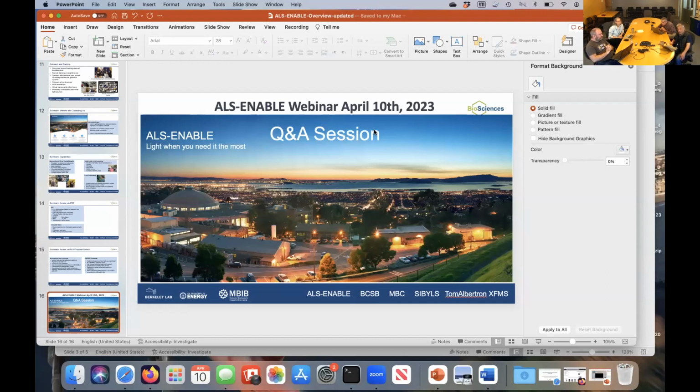I also recommend, if you're collecting and processing data and you're just doing one set of native data, and you've processed and you get the message that says, hey, we saw an anomalous signal, you probably did. This is a quick experiment you could do after processing. Just throw it back up with the robot, do an elemental scan, and it'll give you an idea of what to include, because it's experimental phasing information, and that's always worth including.